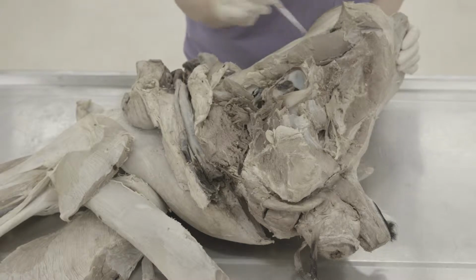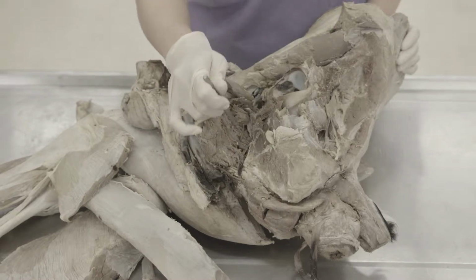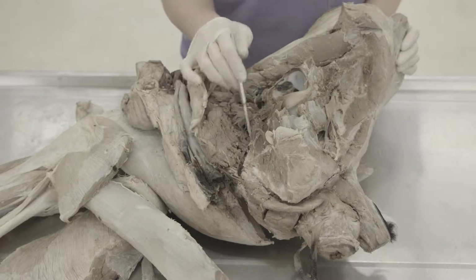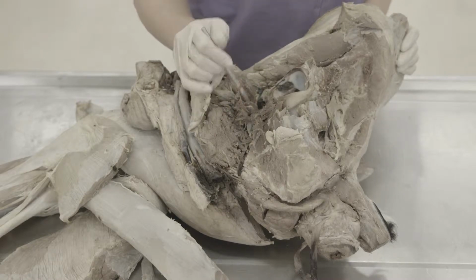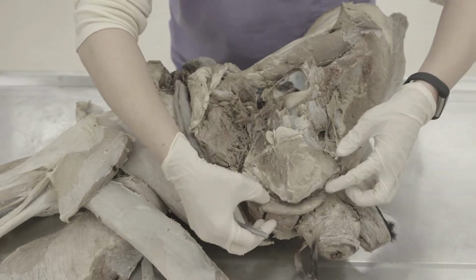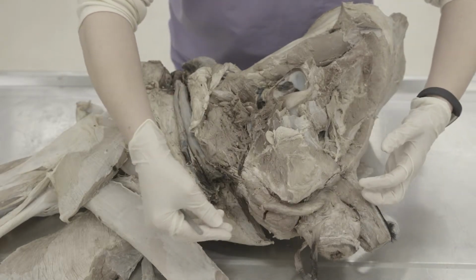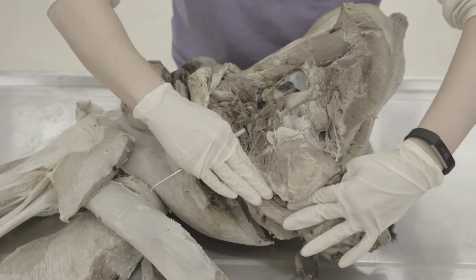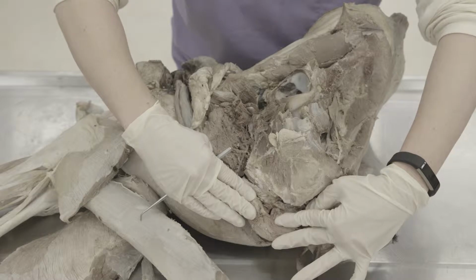And then you're going to have to expose the pelvic symphysis on the midline. So that means you'll have to remove some of this adductor muscle here and expose that pelvic symphysis. And then you're going to cut through that as well, and then all the way through here, which also means you need to cut through the left crus of the penis. So you need to remove that from the left side and just push everything over to the right side.